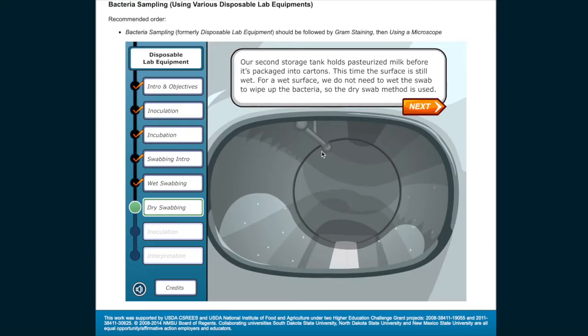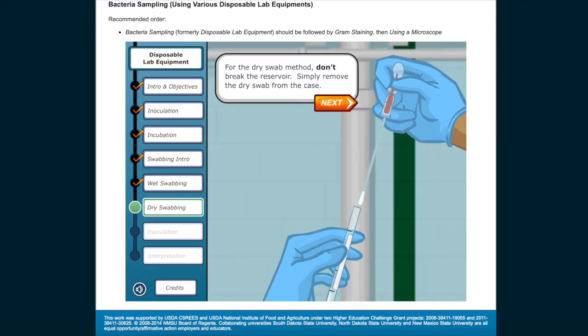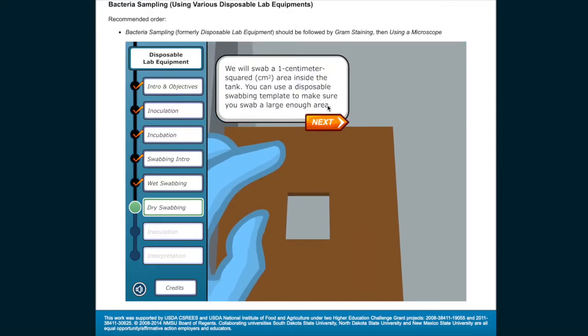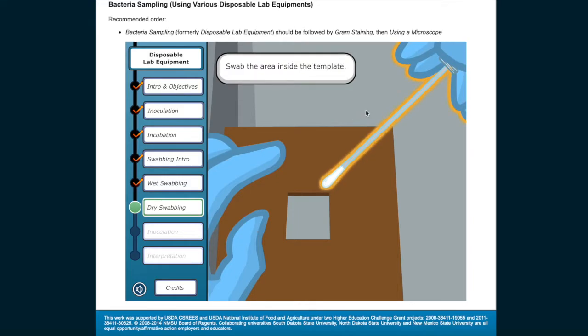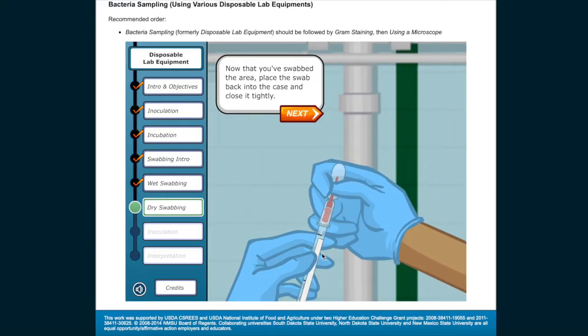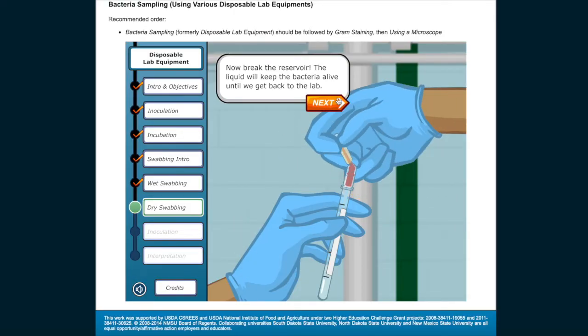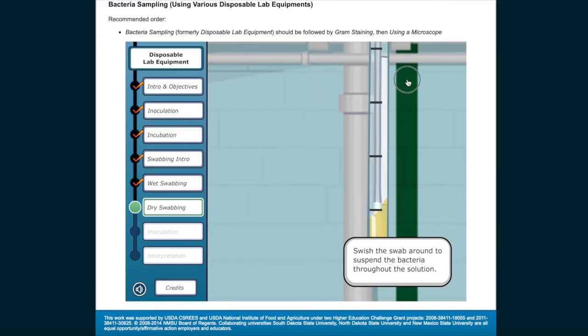Our second storage tank holds pasteurized milk before it's packaged into cartons. This time the surface is still wet, so the dry swab method is used — we do not need to wet the swab to wipe up the bacteria. For the dry swab method, don't break the reservoir; simply remove the dry swab from the case. We will swab a one centimeter squared area inside the tank using a disposable swabbing template. Swab the area, then place the swab back into the case and close it tightly. Now break the reservoir — the liquid will keep the bacteria alive until we get back to the lab. Swish the swab around to suspend the bacteria throughout the solution.